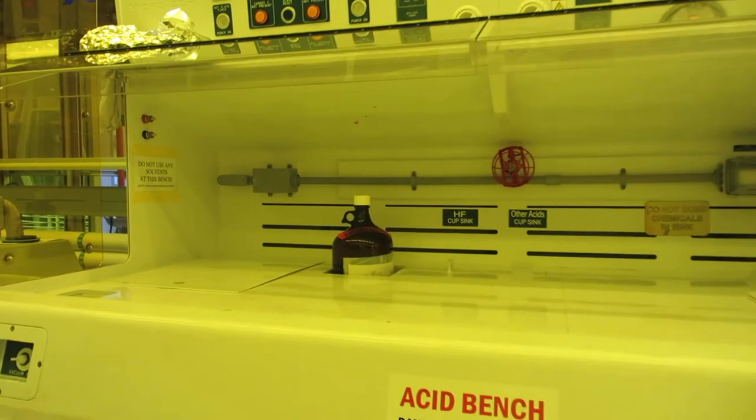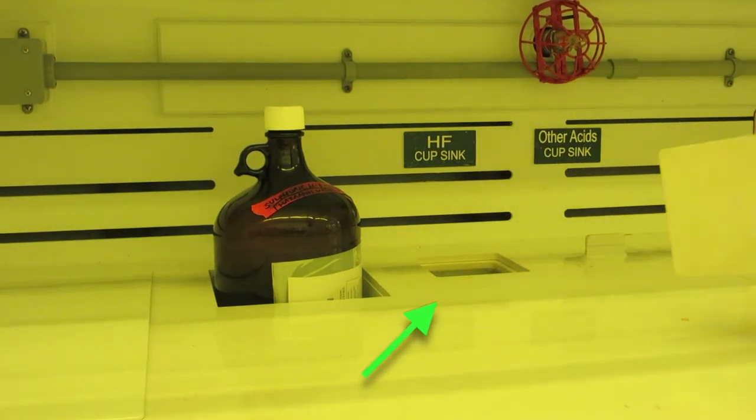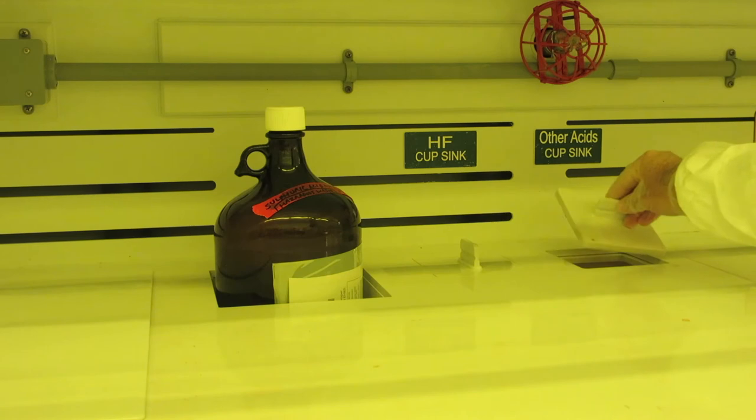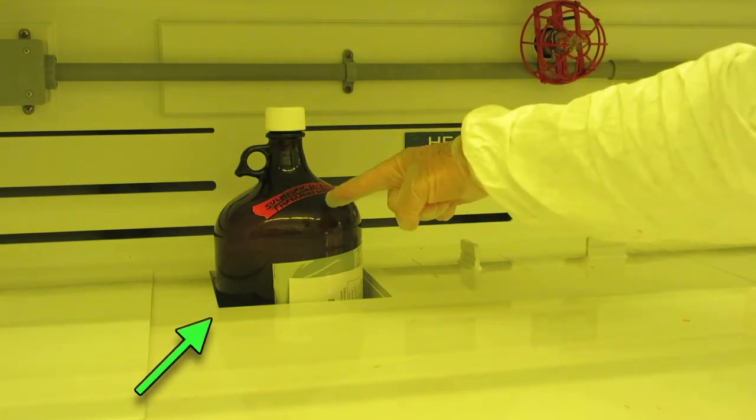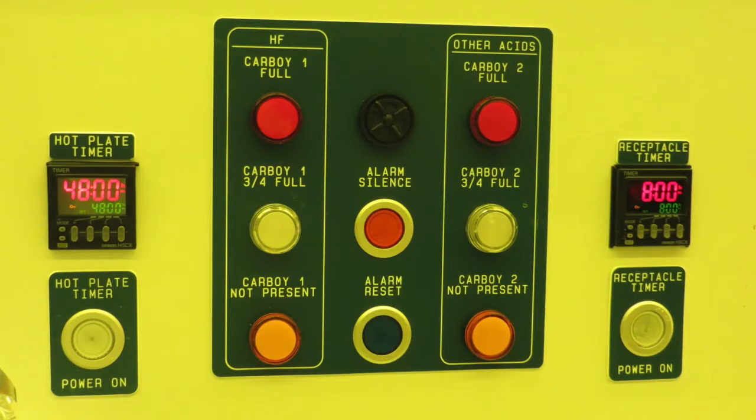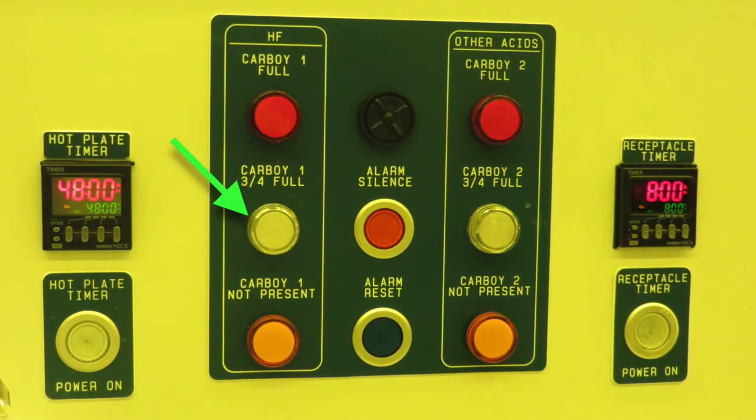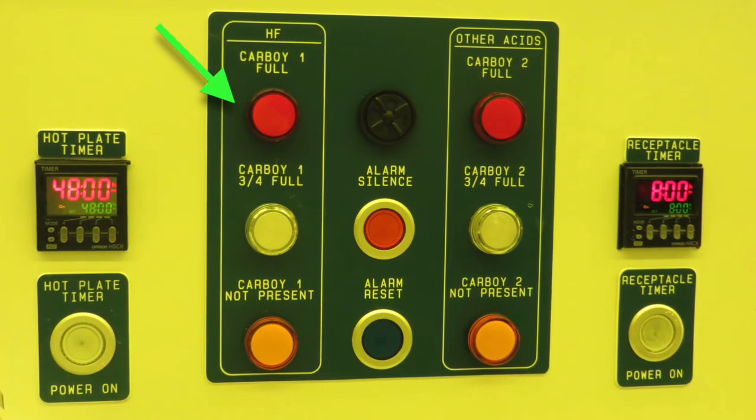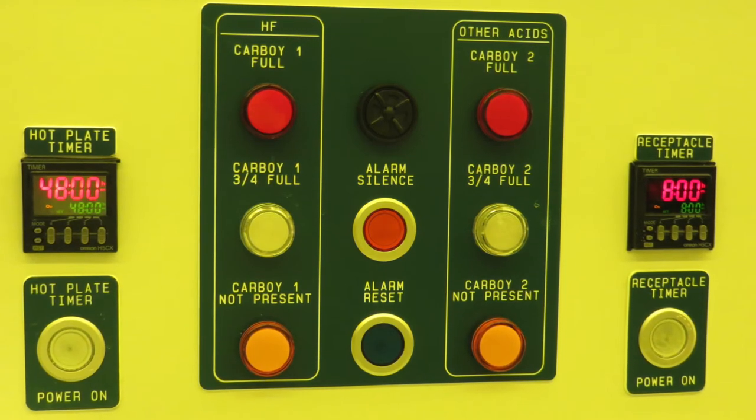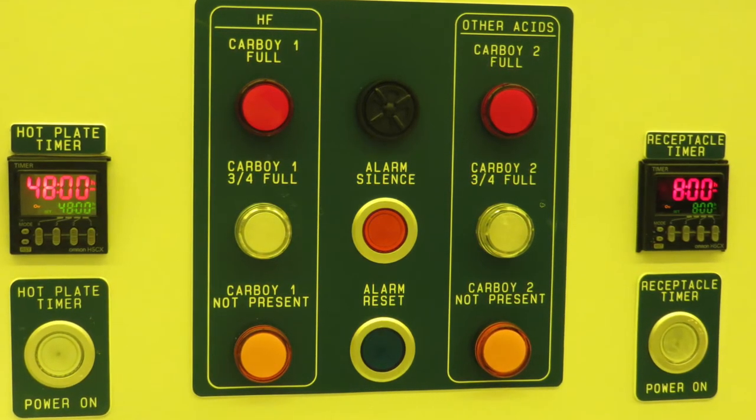Small quantities of most acid waste that you generate can be disposed of in the cup sinks at the back of the bench. This one is for HF mixtures and for buffered oxide etch. And this is for most other acids and etchants that don't contain HF. The brown bottle is for the disposal of small quantities of sulfuric and peroxide mixtures, otherwise known as piranha. The cup sinks drain into five gallon carboys in a cabinet in the service chase behind the bench. When the carboys are three quarter full, a white warning light lights up on this panel on the head casing above. When the carboy is full, a red light lights up and a loud alarm sounds off. A valve closes under the carboy to keep you from adding more and keep you from overflowing the carboy. If this happens, please don't add any more waste to the cup sink. Put a note over the cup sink that it is full and notify the lab supervisor that the carboy needs to be replaced.